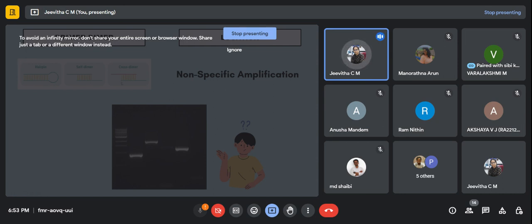And when your opposite primers, like the forward and the reverse primer, both start to form a bond, that is called a cross dimer. And a hairpin is when your primer bends onto itself. I'll explain this clearly when we see the example in our study, it will be clearer than looking at this image.